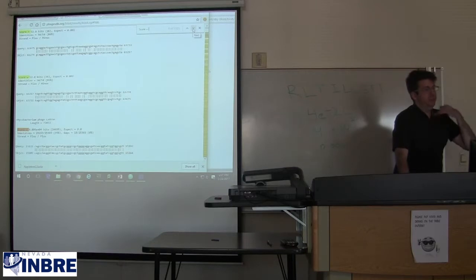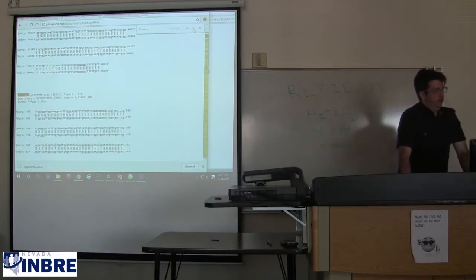The 7th one should be the next subregion of LeBron that hits. And so that's another 13,396 letters that were aligned with a single gap somewhere within them, 98% identity.